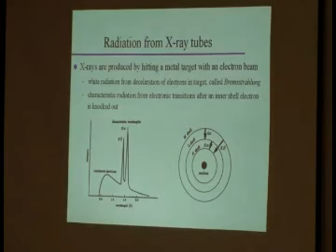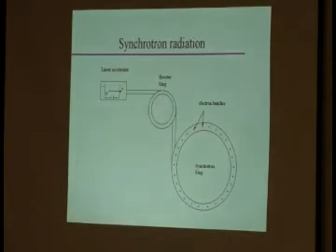More questions about the X-ray tube? In that case, let's move on to the synchrotron. Synchrotron radiation takes a little more to produce than an X-ray tube. This is a very simplified schematic of what a synchrotron looks like, but it shows you all the important pieces.